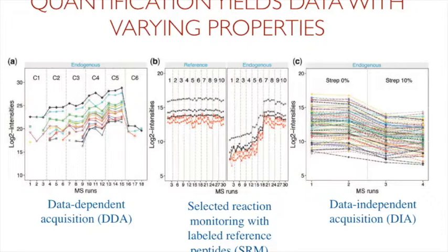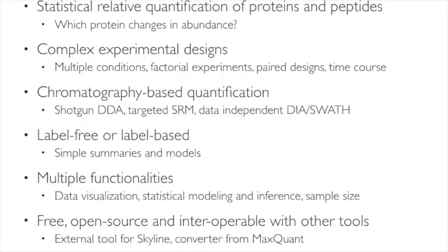Of course, when we do this type of analysis, it's really important that we account for the properties of the data. So that's what we set out to do. We developed MSstats, which is by now, I would probably say, 5 to 6 years old or more. I can't even tell. It started as a very small project which grew in time. And so the goals of MSstats are as follows.